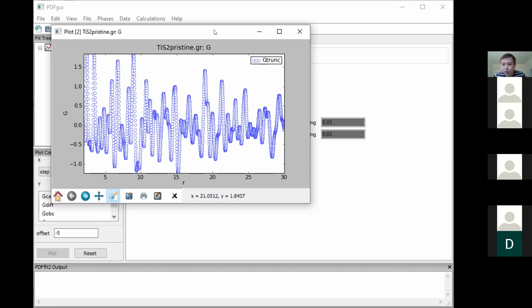So if you go to the other end, for example, if you use a point detector and you go to APS, you use the 11-BM, you have very well resolved peaks, and that helps you to solve the structure. But for PDF, those peaks are not resolved, a lot of overlap.